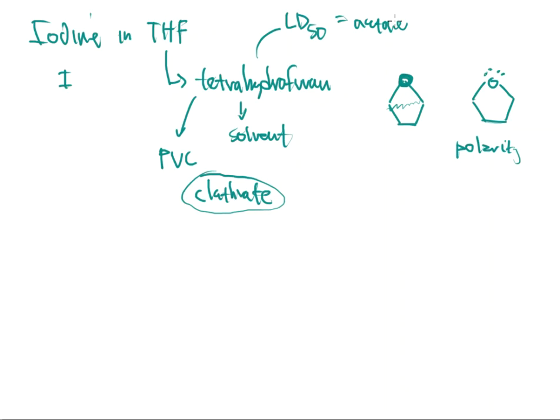It does dissolve latex gloves, so you cannot wear latex when you work with THF. It will just eat right through those gloves and it will go right onto your skin. So you're going to have to choose something different than latex, and this is one of the reasons that we do not have latex gloves lying around for the most part, because chemicals like this can react with them. It can eat the latex, so why even bother purchasing them? So we get the chemical resistant gloves instead. So that's a little bit about THF.